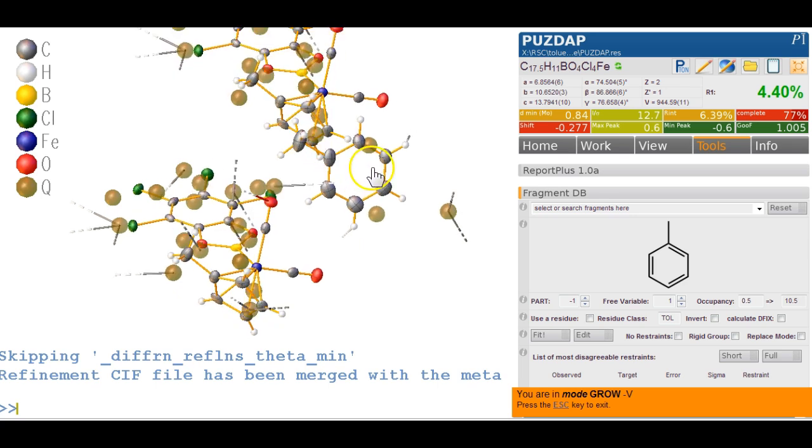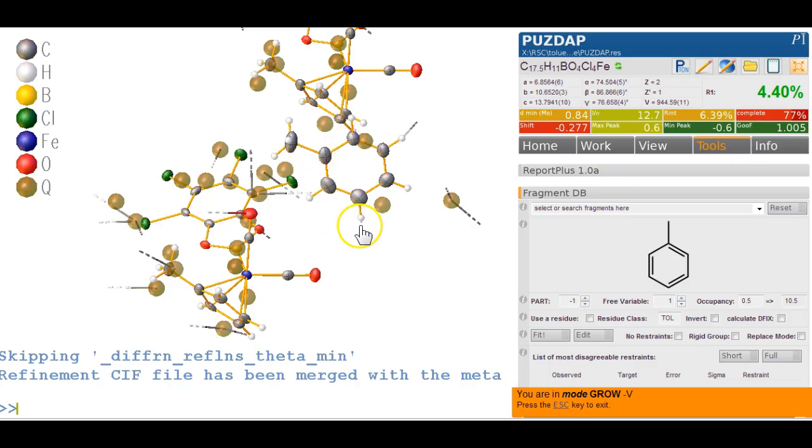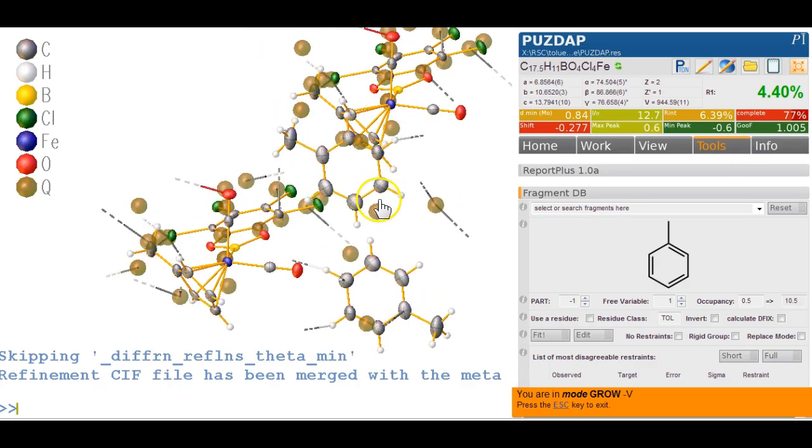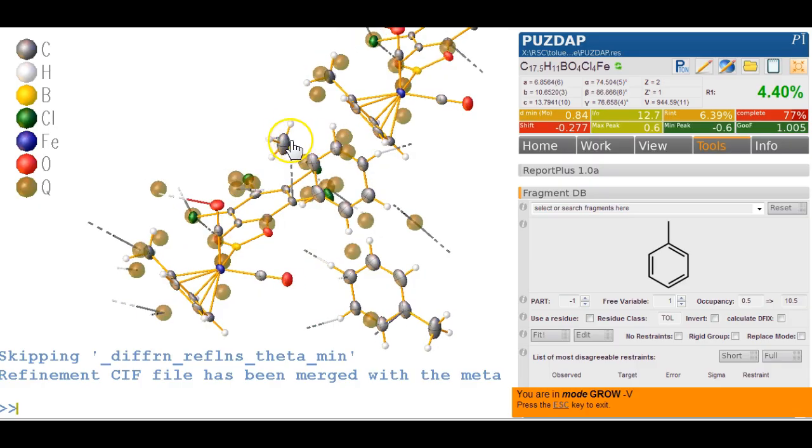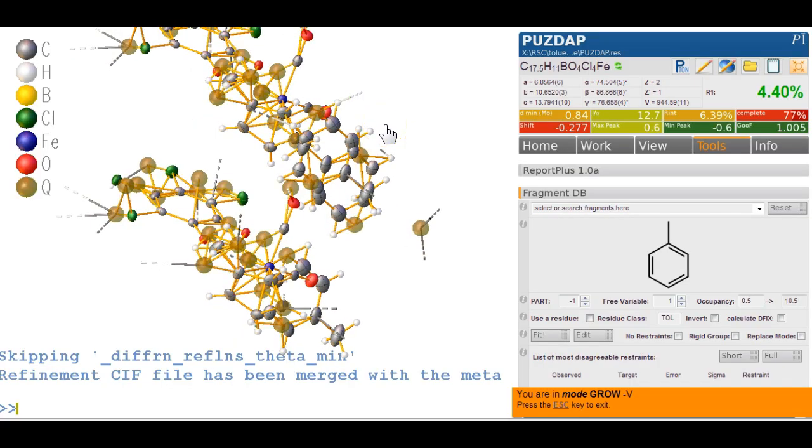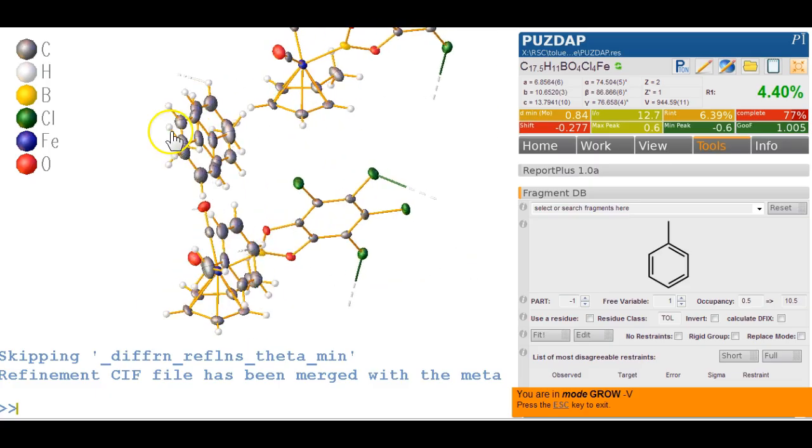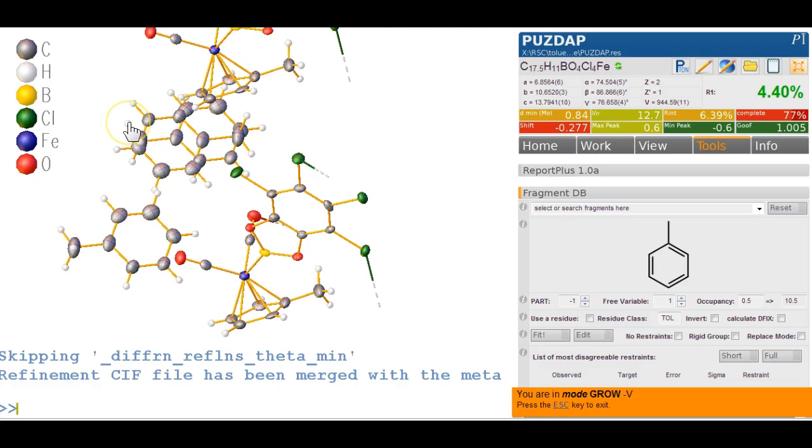This was not the right one to use, let's try this one here, no, there's one over here that we need, so it's a bit fiddly maybe, but now we go, we've got the overlaid control Q again to see it. So we see how this molecule is overlaid on top of each other here across the symmetry element.